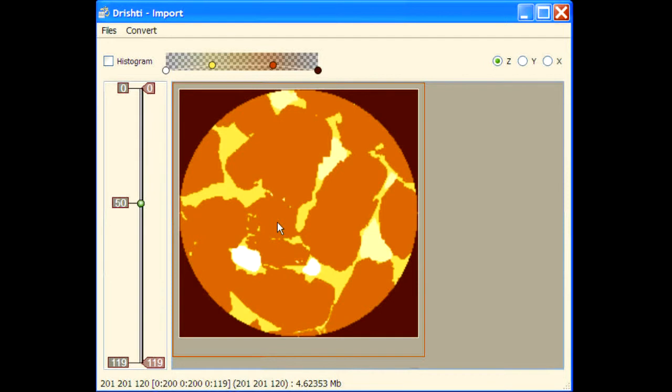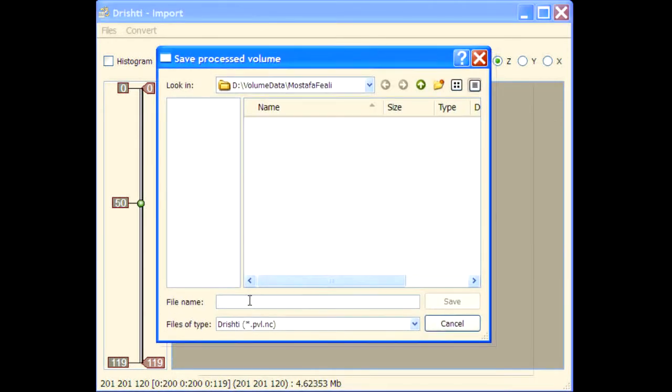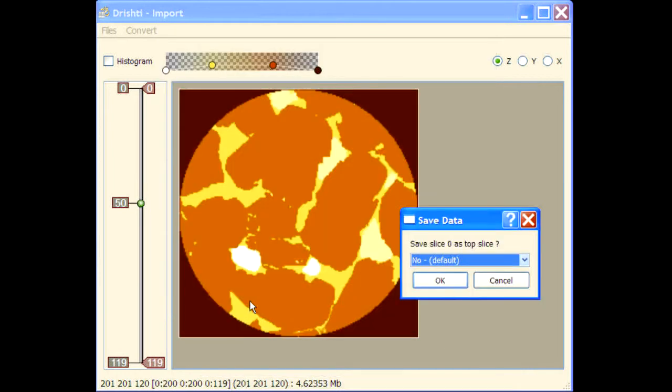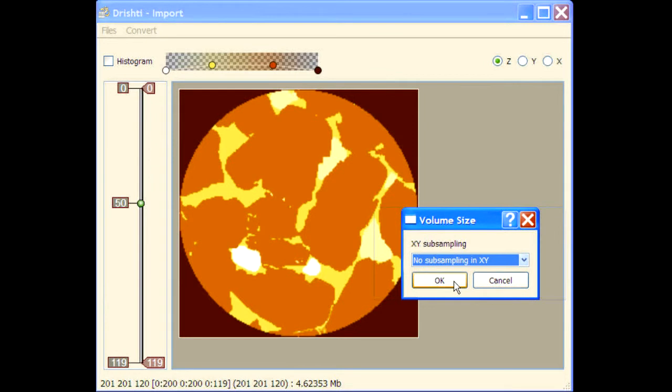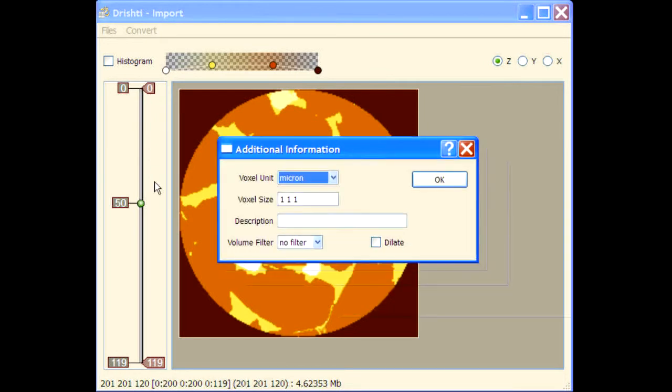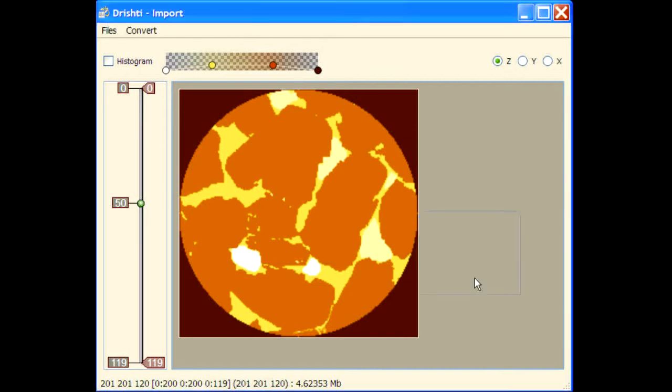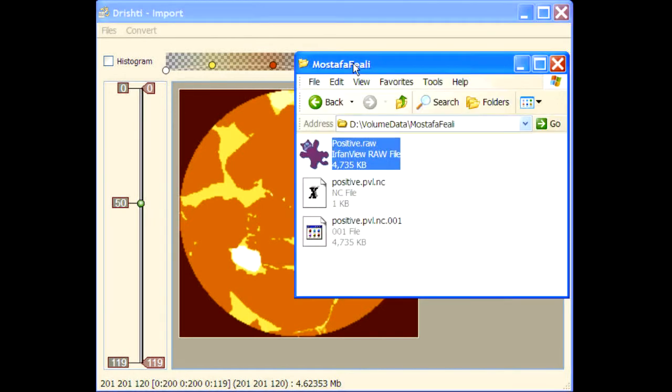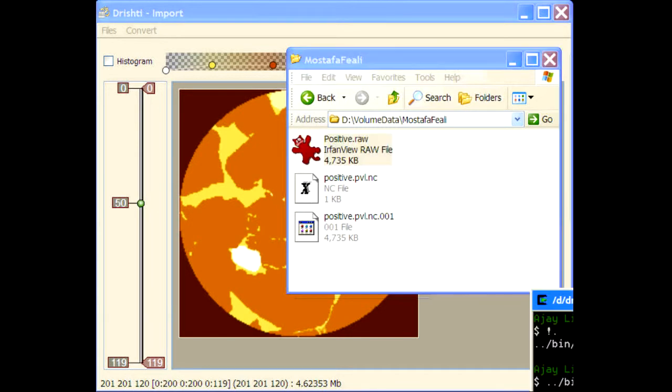Press S and you can save, so positive dot pvl dot nc. I'm not going to apply any filter right now. Done, so you have got this positive dot pvl dot nc file.